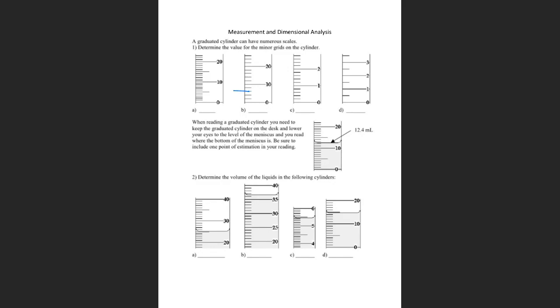I start with that and figure out what is called the range. The range is how far out the major graduations are spaced. Actually, the range is the whole thing. This small part here is called the increment. Anyways, from here to here is 10.